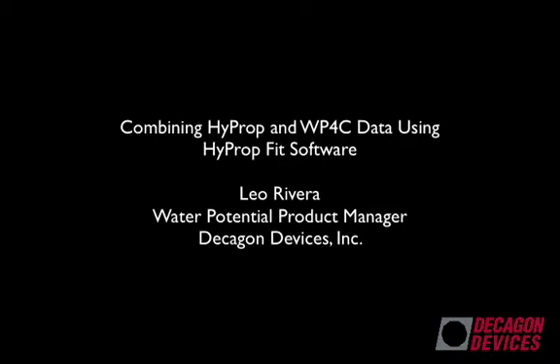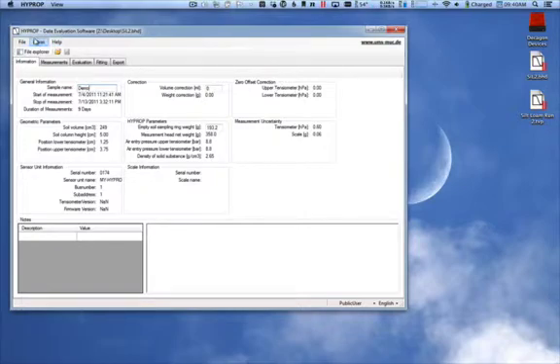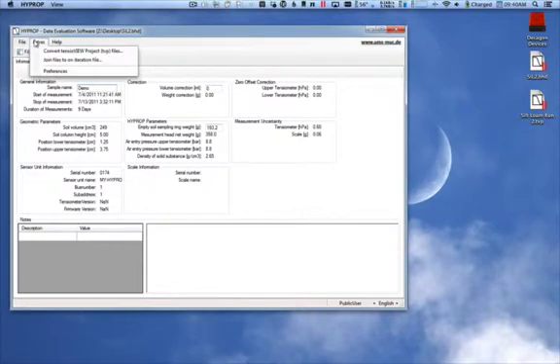Combining HyProp and WP4C data using the HyProp Fit software. To begin, in the HyProp Fit software, go to the Extras tab and select Convert Tensio View Project.